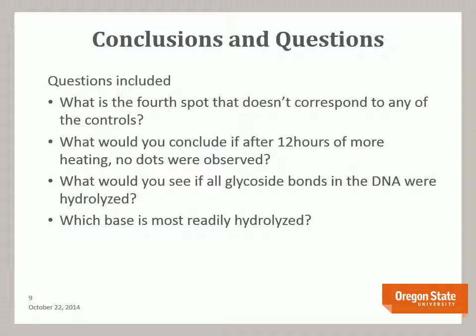Next was, what would you conclude if after 12 hours of more heating, no dots were observed? The correct answer would be that the compounds had broken down even further to small molecules that could not be observed by thin layer chromatography.